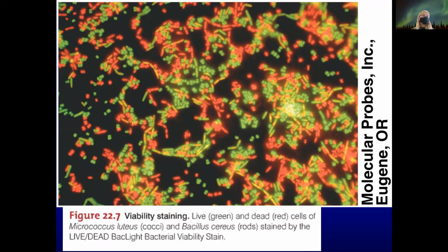Here, looking at acridine orange, where the live and dead cells are showing, oh no, this isn't the acridine orange, sorry. This is a different viability stain. But unless you're colorblind, this would be difficult if you're colorblind, you can clearly pick out the red and green quite readily under the microscope in this case. And so the epifluorescence is definitely a lot safer and a lot less expensive as well.